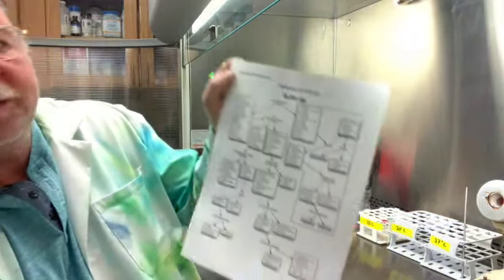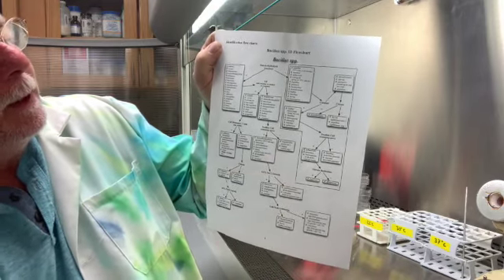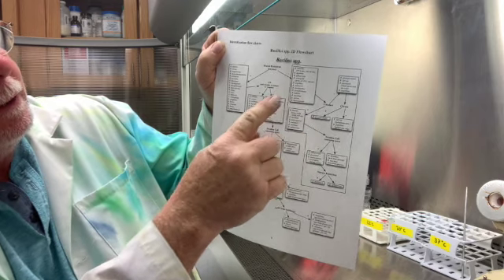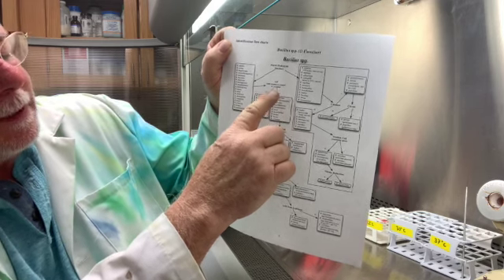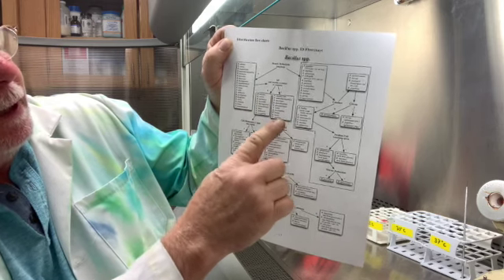And then we got to go to the chart that is Bacillus species, because there are tons and tons of bacilli. Okay, and so then we'll do a starch hydrolysis, and we'll have explanations and show you these tests. Here's the group that it would be if it was a positive starch hydrolysis, this side if it's negative. If we do go positive, then we'll look at another test called Voges-Proskauer, which is VP test, and then we look at the positive negative.